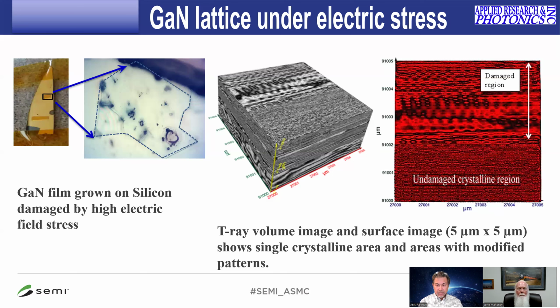The images are always frozen in time, meaning that once I put the sample or TEM grid inside the TEM, it stays fixed, and I get a single image on that 3 millimeter or so area, from which we can determine the lattice structure.